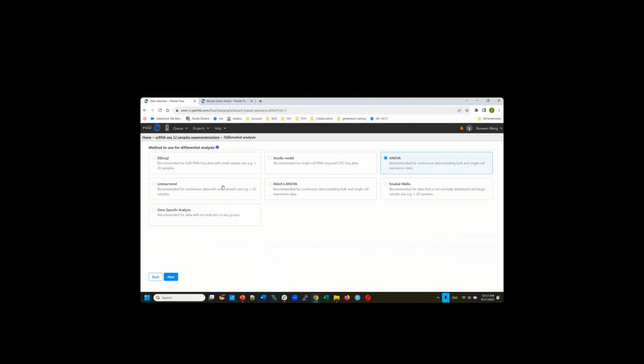So suppose I want to compare the cell type and I want to remove the batch, just add cell type and batch, both factors, into the model. So the algorithm will partition which variation comes from the batch and which comes from your biology effect. It will take care of that.